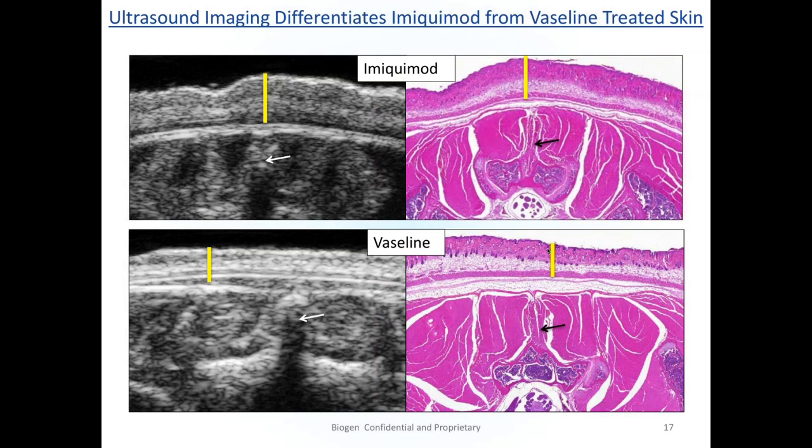Yeah, I think so. And I think that at the time when we started those studies, because I believe your instrument is relatively new, is that correct? That's right. So the clinical instrumentation is changing considerably, and the information that I was going off of, the clinical hearsay that we were basing this on, was a while ago. So that landscape could certainly have changed, and it might be an option. If the higher resolution, the higher frequencies are available now, it'd be nice if somebody would check it out and see if they can measure something.